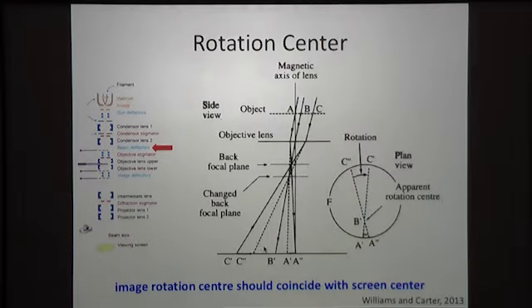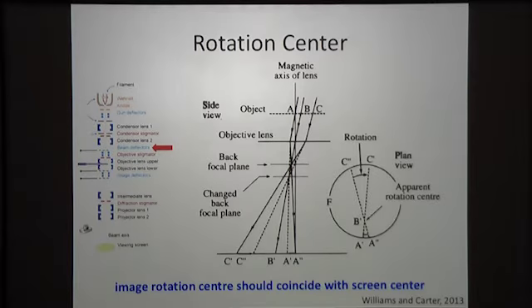So, how can you tell that you've got a tilted beam? As you change focus, you're changing the focal planes, so the positions are moving here, but because of the helical path of the electrons, as they move, they go in a spiral path. When you change focus, the focal plane, they're also rotating, they're changing position. So they're going here, then they're moving in a helical path.